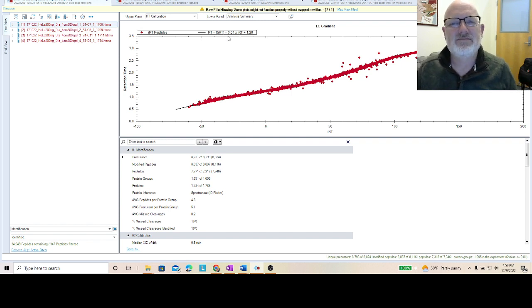Okay. So for this quick video, hopefully it won't be more than 10 minutes. I'm going to look at Spectronaut 17, some differences between the different ways to search, direct DIA and library searches. And we're going to look at some of the 300 samples per day method, which is about 3, 3.5 minutes.